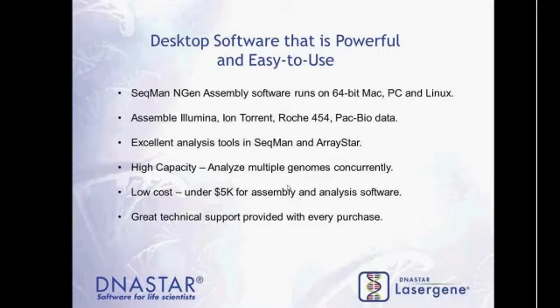And that's part of my role at DNA Star, is that I focus on the next-gen customers. So if you do have questions or very difficult projects that you need some assistance on, the service plan that's provided with our software gives you access to myself and other folks at DNA Star. Oftentimes we will look at projects, work through problems together, do webinars like this, but one-on-one webinars, and we can get you through any difficult problem that you might encounter.